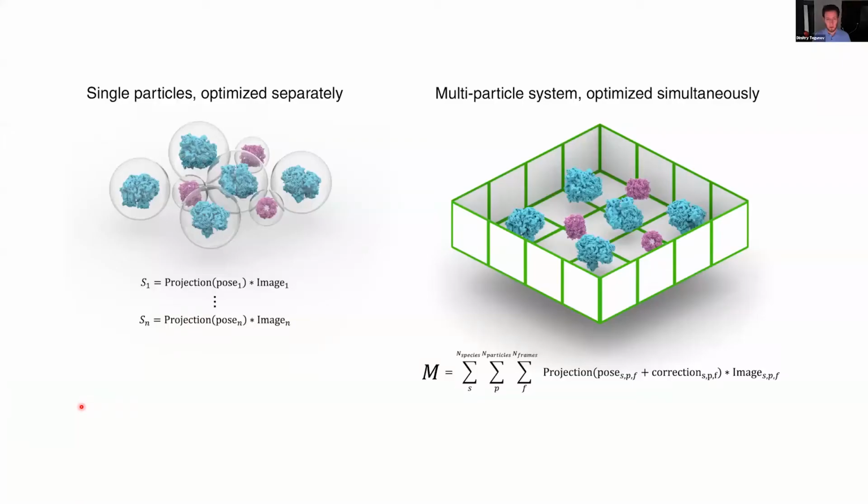And so the way M makes use of this is this. So one of the main assumptions behind single particle average is that, in fact, we treat each particle as a single particle in isolation, and then we run its own tiny optimization for every single particle, and then we average them using those optimized parameters. Now, what M implements is what we call multi-particle refinement.